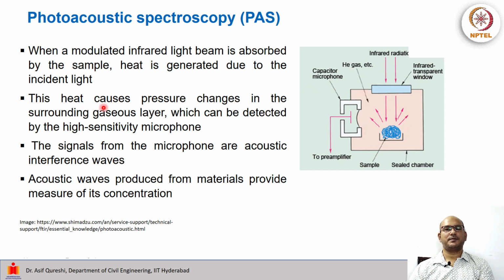Now heat causes pressure changes in the surrounding gaseous layer, which is then detected by the highly sensitive microphone. So this is our microphone. The signals from the microphone are basically the acoustic interference waves, and the acoustic waves produced will be a measure of the concentration of the analyte.